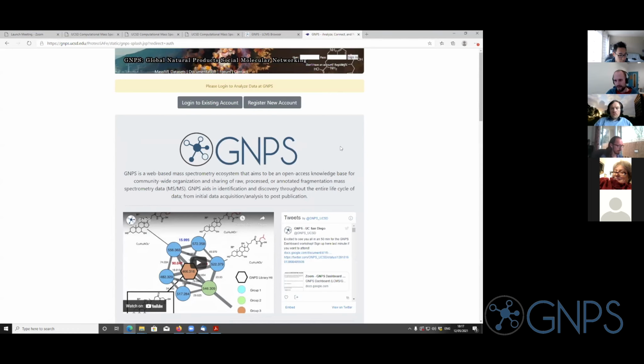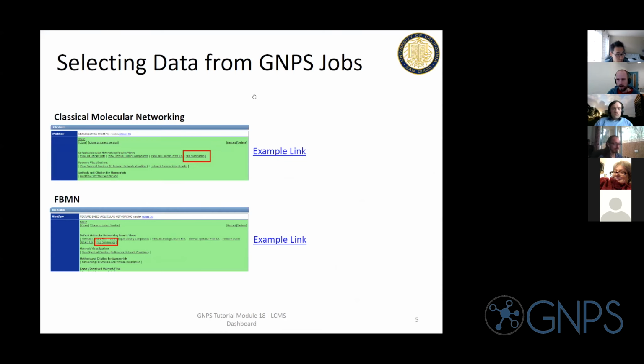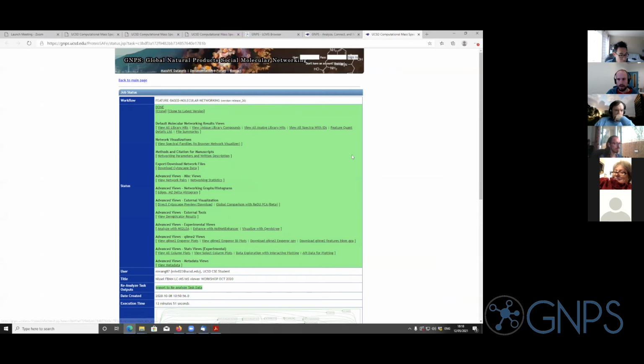For the time's sake, we're not going to go completely through that. If you're interested and want to learn how to launch a feature-based molecular networking job, we did this in the past, and there's a recording from that workshop. So I would refer you to our documentation page where you can watch it on YouTube. But more importantly, for now, we can just use this example link and open the same network from the same data from a feature-based molecular networking job. So this would be the final result.